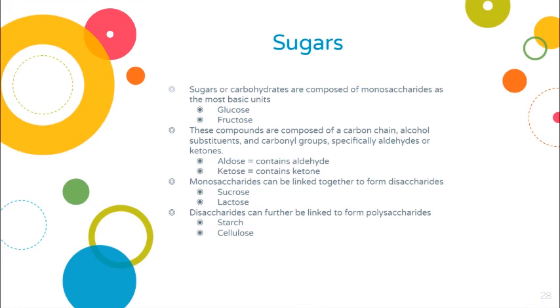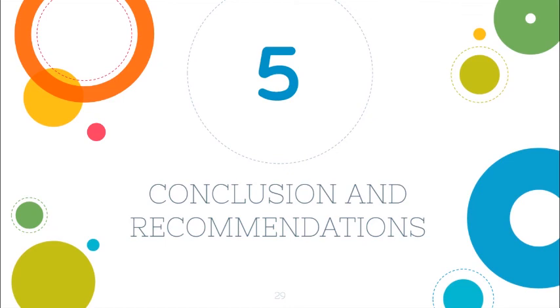Glucose, a monosaccharide, contains an aldehyde, thus being classified as an aldose. This aldehyde group is ready for oxidation, thus showing positive results for the tests. Fructose, another monosaccharide, contains a ketone and thus is classified as a ketose. However, it tested positive for the tests for aldehydes. The reason for this is that fructose is a type of alpha hydroxy ketone, thus showing positive results for the tests for aldehydes.